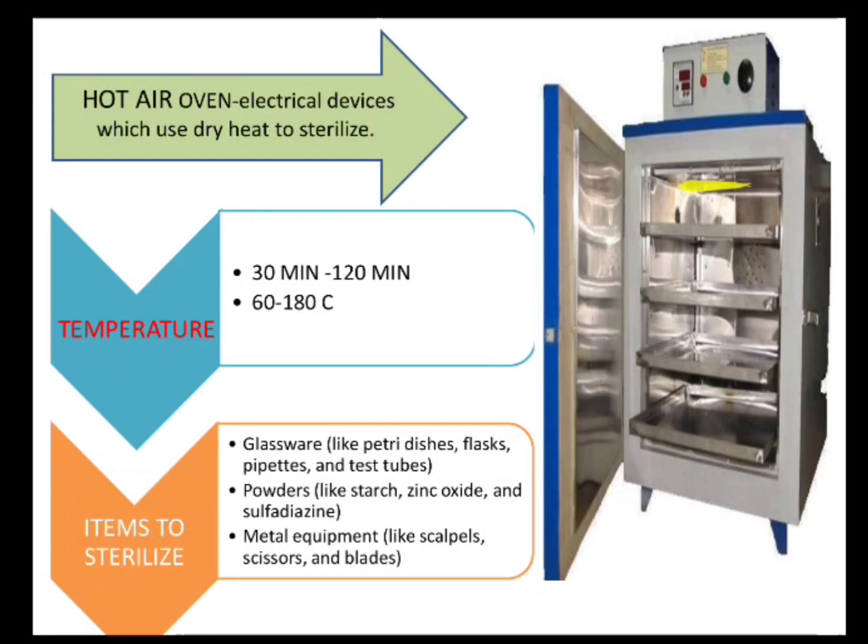Also it is thermostatically controlled, the temperature is maintained here, wherein through the electric supply, the electric energy is converted to heat. There are coils that are placed on top as well as on the sides. So when the heating happens through the coils, the temperature increases, and then the uniform distribution of the heat happens through the circulation of the fan.